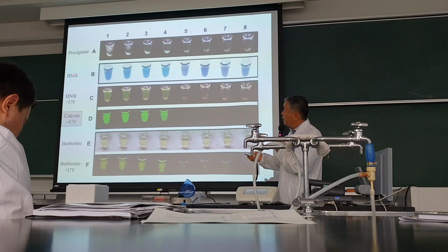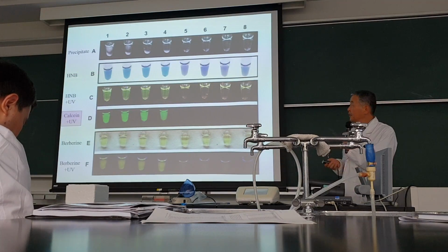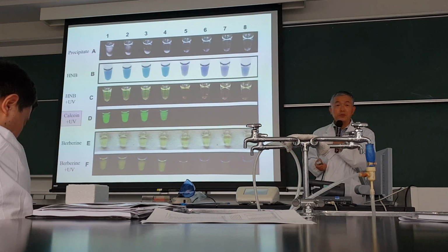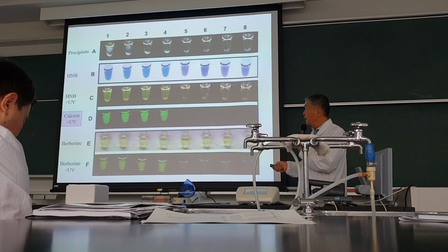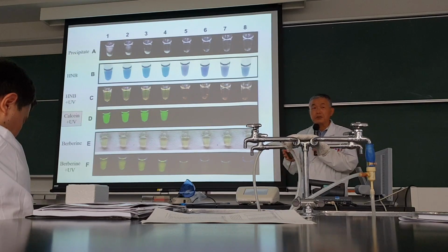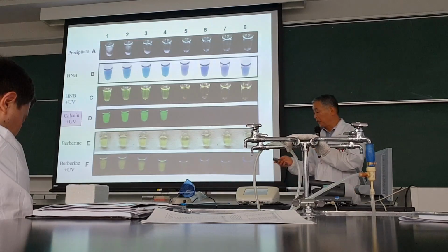When the gene is amplified, the color becomes blue from purple. Some reagent is sensed with the UV system. Today I'm going to use this system, but the signal can be detected by the machine itself.